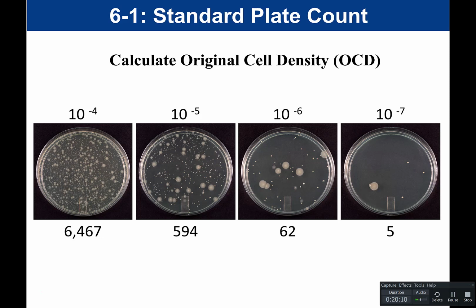That is going to affect how fast that bacteria replicate. And the reason, as you're going to learn throughout the semester, is that when bacteria grow aerobically, meaning in the presence of oxygen, they get the greatest yield of ATP. Doing aerobic cellular respiration, they can get between 30 to 32 ATP per glucose. The bacteria that are growing within the agar, in the middle, are growing anaerobically, meaning without oxygen.